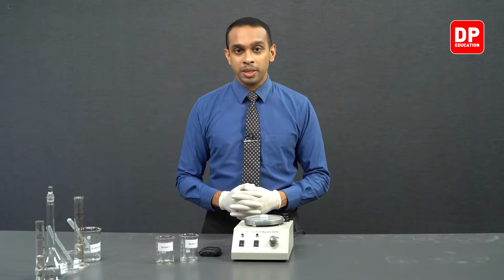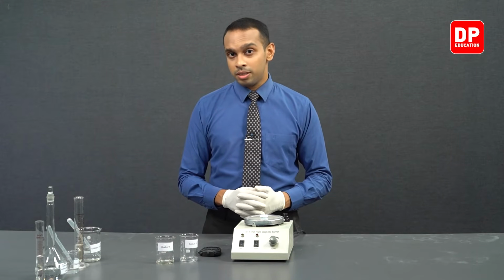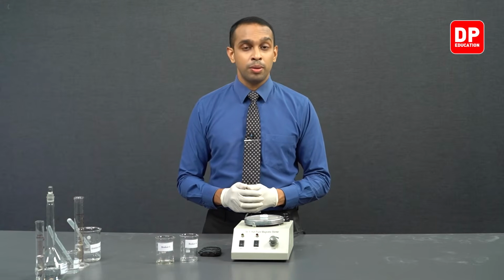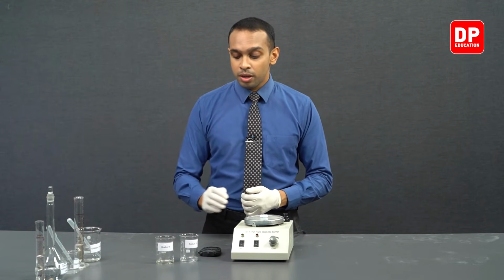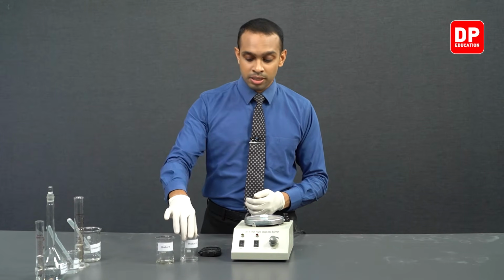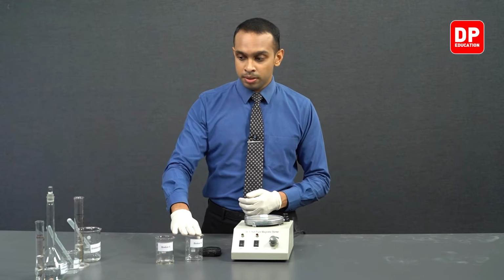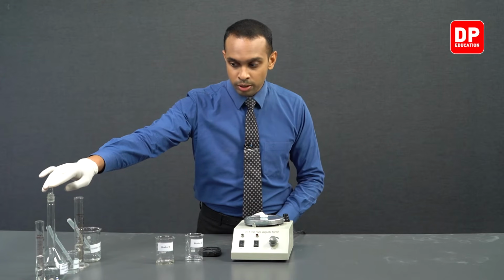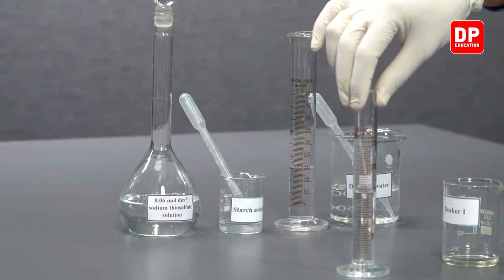Now students, we will be repeating the same steps for the fifth experiment as well, but in this experiment we will be taking only 5 cubic centimeters of acidified Fe3 plus ion solution. So we will be measuring 10 cubic centimeters of potassium iodide into beaker 2, and then we have 15 cubic centimeters of sodium thiosulfate measured into this measuring cylinder.